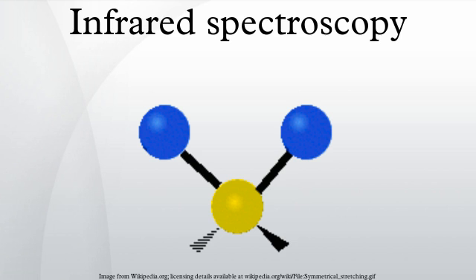Simple diatomic molecules have only one bond and only one vibrational band. If the molecule is symmetrical, for example N2, the band is not observed in the IR spectrum, but only in the Raman spectrum. Asymmetrical diatomic molecules, for example CO, absorb in the IR spectrum. More complex molecules have many bonds, and their vibrational spectra are correspondingly more complex, that is, big molecules have many peaks in their IR spectra.